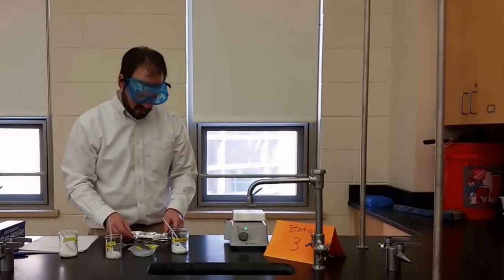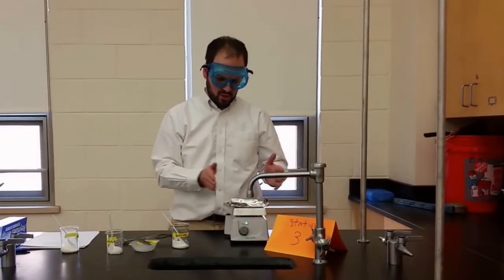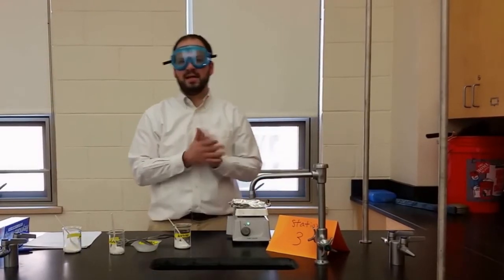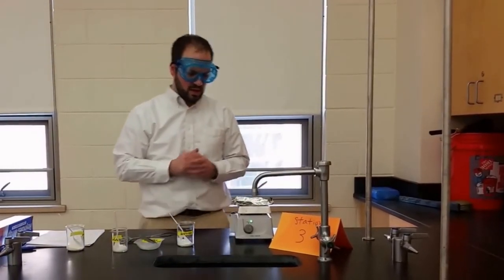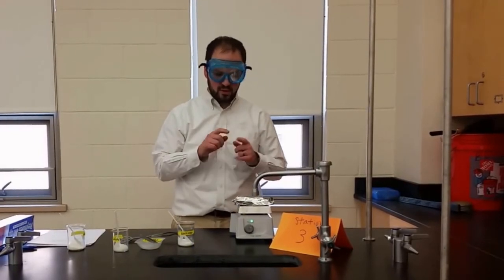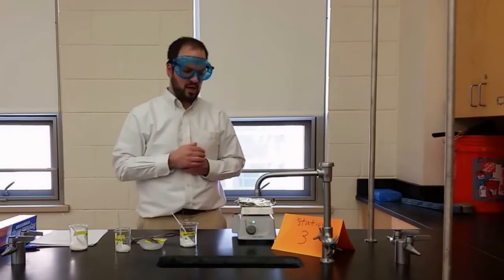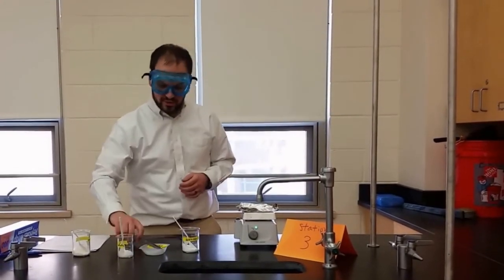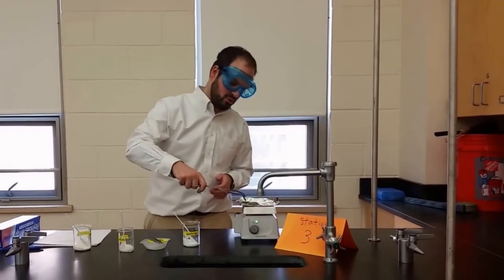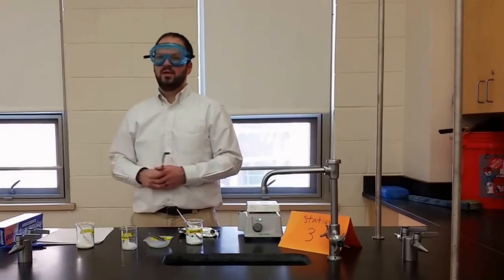Right. Then you're going to very, very carefully take the aluminum foil boat and put it on the hot plate. Notice mine actually overlaps a little bit. That's not a good thing. You want to make sure that yours gets on the hot plate exactly right. And you're going to be watching very closely to record the order in which these chemicals melt on the hot plate. Okay. At the very end of the station, you're going to take your metal tongs and pull this off the hot plate, let it cool for a moment at the desk, and then put it into the trash.